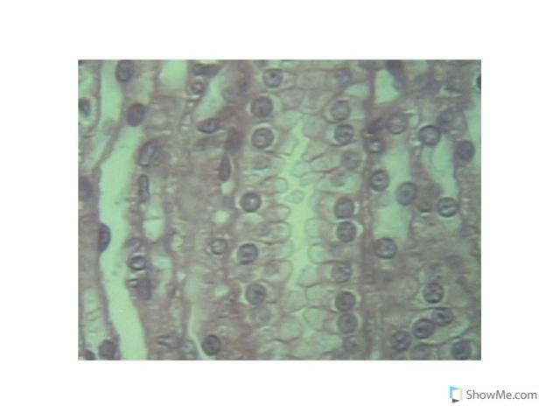You may recognize this as being very similar to your kidney sections. Here I'm going to draw where the basal lamina would be on both sides of this gland, and the free surface here in blue.